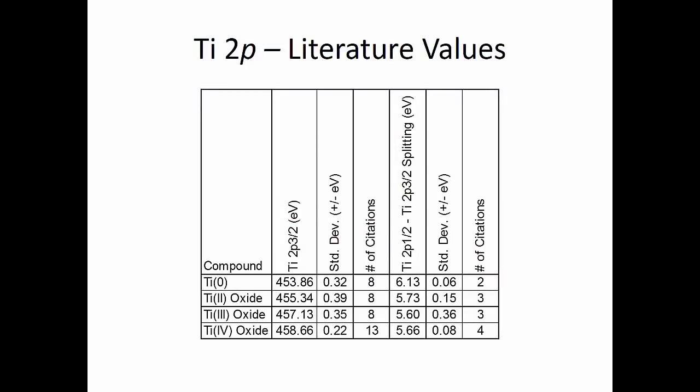If we look at the literature values for the titanium 2+ and titanium 3+ oxides, we're going to use these binding energies that we get, which are an average of all the different citations that are out there. We're going to constrain the peak positions to be a certain amount below the titanium 4+ oxide - about 1.5 eV below for the titanium 3+, and about 3.3 eV below for the titanium 2+.